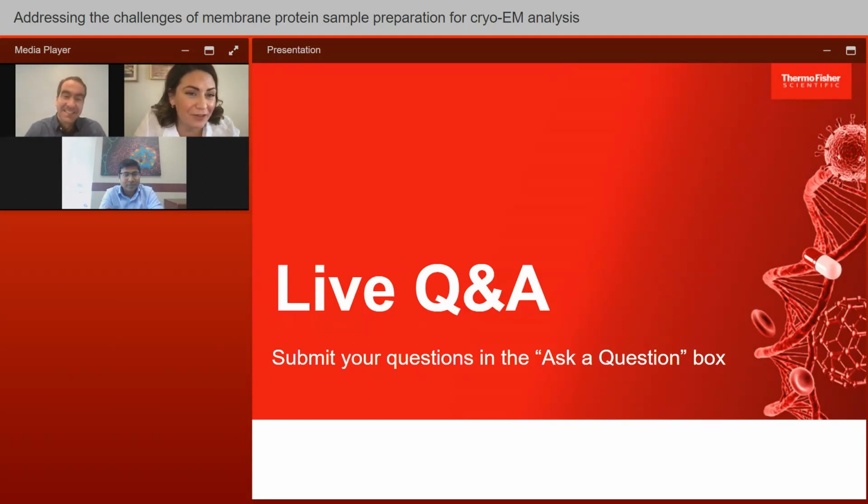That's an interesting question. It's going to be different depending on your protein, right? And actually we put out a review on this in 2020, I think, one of those fun COVID projects, where we compared the different detergents, the different protein families. The one that I put up in my talk had the different protein families and the different detergents that we use for the structure determination condition, but we actually also analyzed the different detergents that we use for solubilization and how often an exchange is done. So I think that's probably the best place to go and look for your specific protein of interest to get a guide as to where to go.